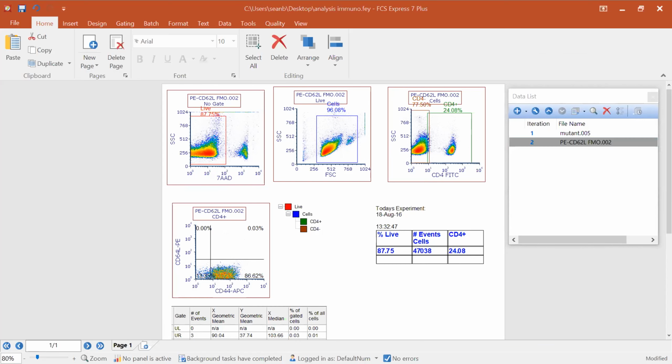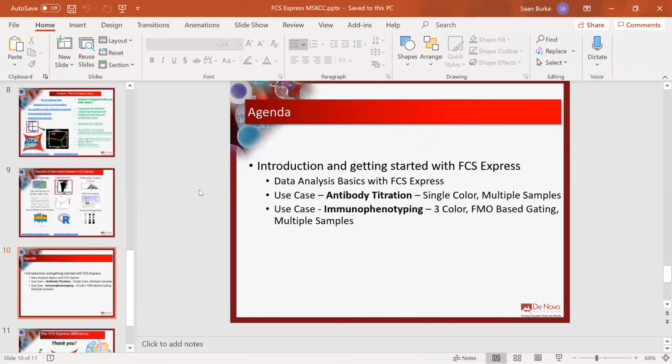So again, you can start typing in some questions if you have any. I just wanted to recap what we talked about in the second workflow here. If you have bigger data files that have more parameters, or lots and lots of data files, you can set up FCS Express to be a templated analysis for as many parameters as you want, for as many data files as you want, utilizing the batch processing, batch exporting to PowerPoint, to PDF. We can also go out to things like Excel and export directly to images. It's always a really great way of performing analysis.